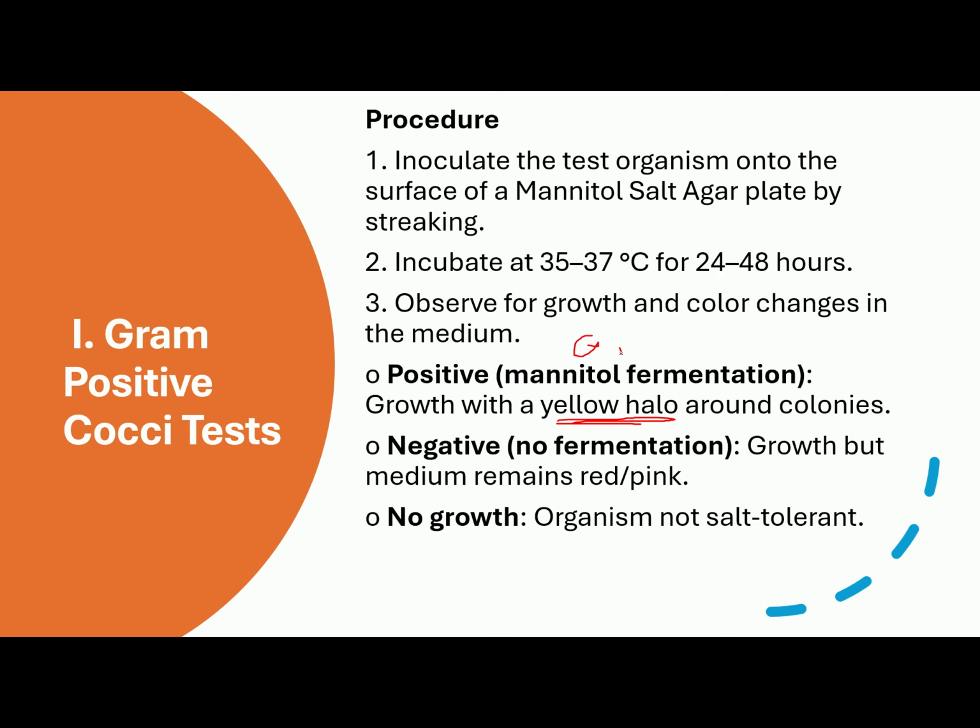meaning the bacteria is salt tolerant. If it's negative, no fermentation, there would be growth but the medium would remain red or pink. If there's no growth, the organism is not salt tolerant. So take note of this, class.